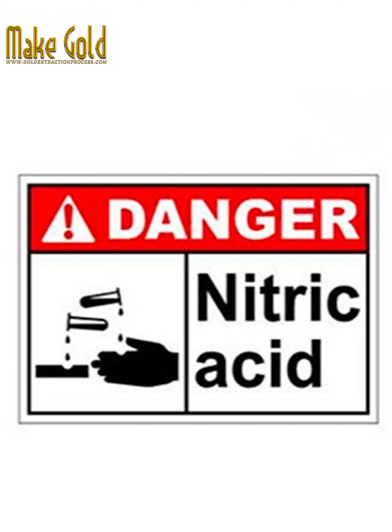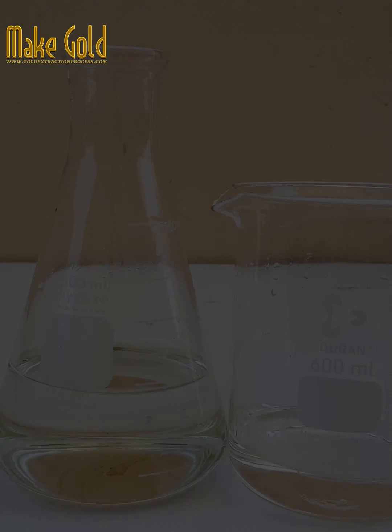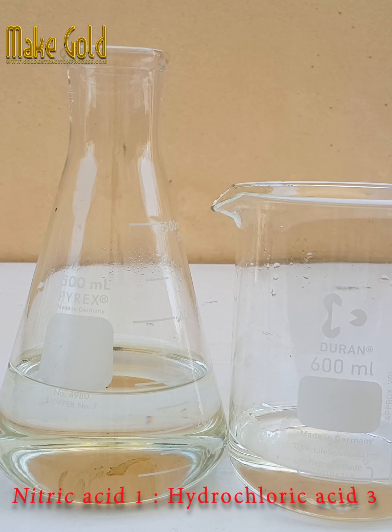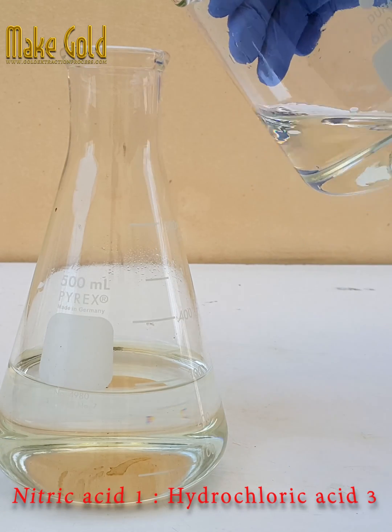Choose a suitable container. Aqua Regia is highly corrosive and can dissolve many materials. Therefore, you should choose a container made of glass or plastic that can withstand the acidity of the mixture.